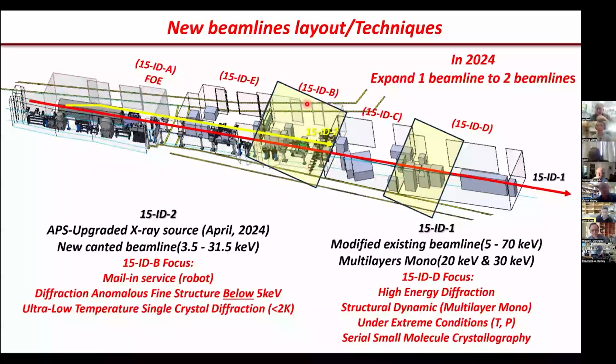Hi, Yushan. Hi, Miguel. How are you? I wanted to ask, if we were there, would we be able to use ID1 and ID2 simultaneously? Yes, if you request. For example, when you come here, we can arrange it if you have an air sensitive crystal you want to use the LOBA for, but you also want to do some photocrystallography. That can be arranged, but I'm not guaranteeing you can get it on the same day.